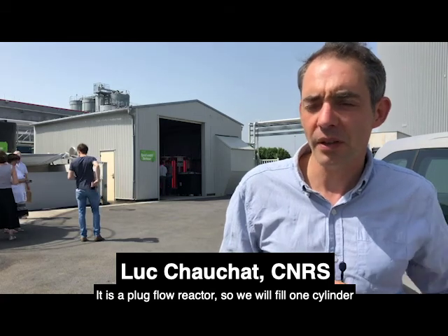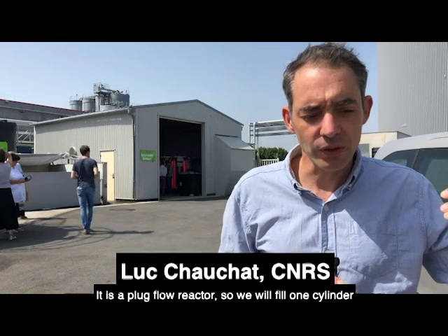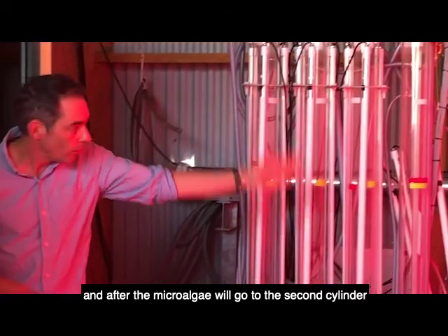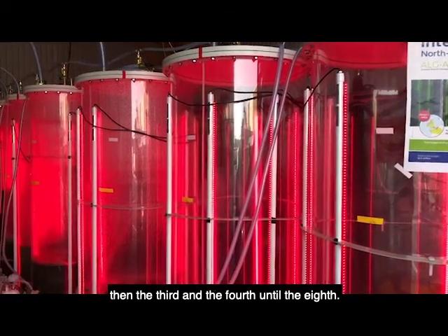It is a plug flow reactor, so we will fill one cylinder, and the microalgae will stay only a few hours in one cylinder, and after the microalgae will go to the second cylinder, then the third, the fourth, till the eighth.